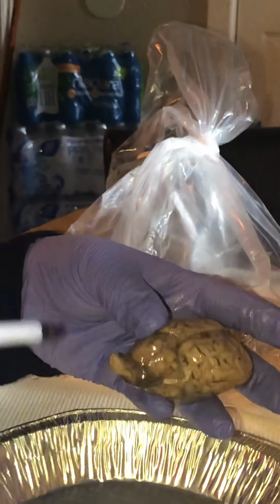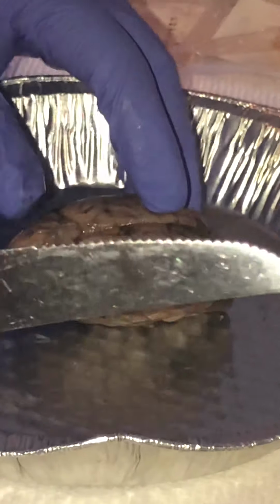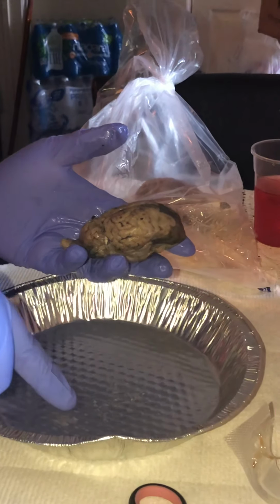Let's keep going. Well, you know what? Yeah, okay. So let's go ahead and cut this thing open. But first, before we go, I just want to make sure I'm covering everything. Talk about the gyrus and the sulcus.